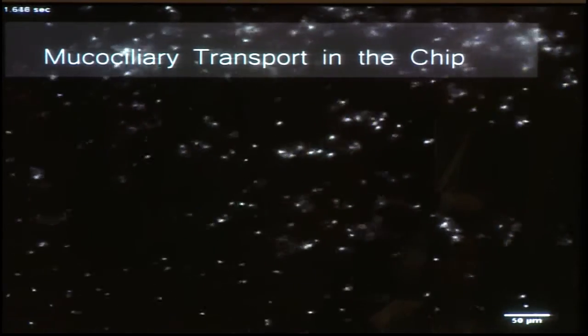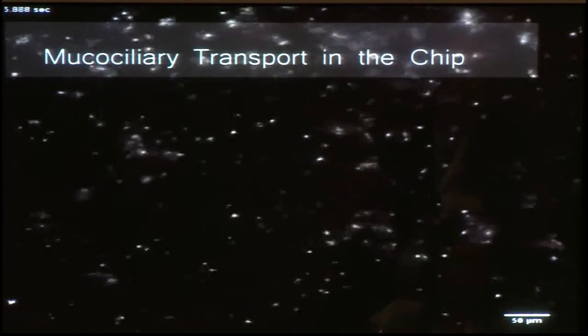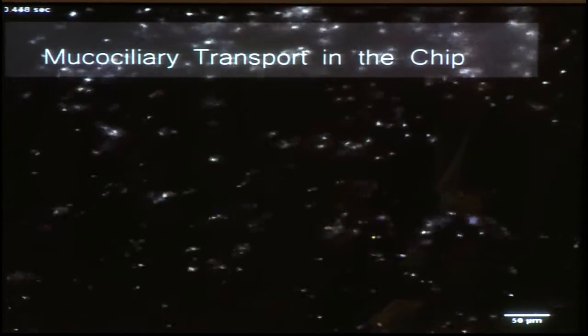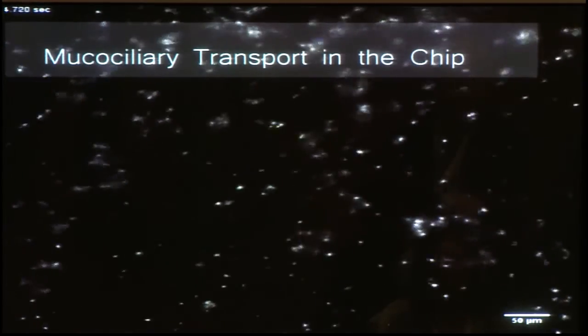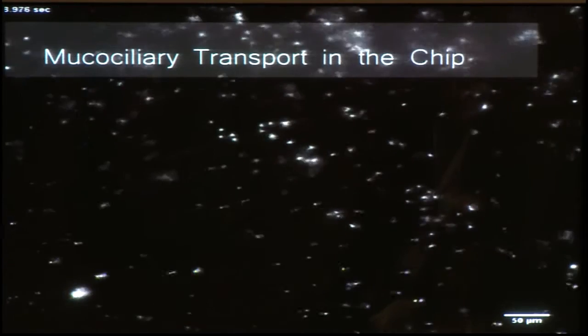And when we introduce fluorescent beads inside the chips, I'm not sure it's very clear, you can see that the combination of the cilia beating and the mucus secretion start this mucociliary transport that is visualized here with these fluorescent beads.